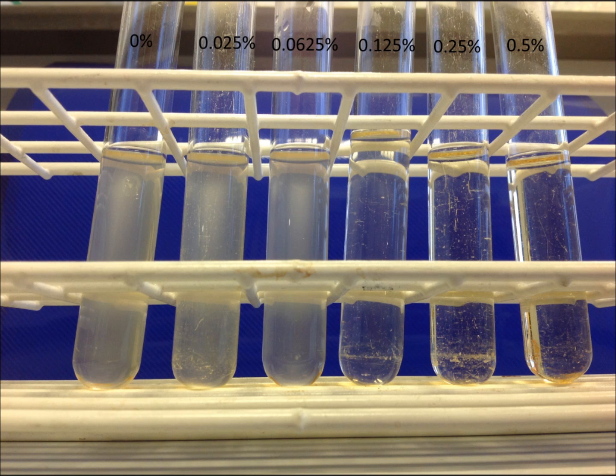All you need to do is to take a loop full out of each of the tubes and to streak them onto an agar plate. If there are live bacteria in there then you'll get some growth on the plate.